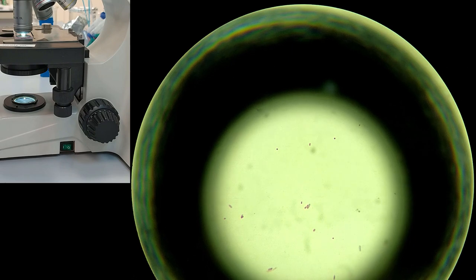Here you can see the rods and the bubbles. And this is the mix of bacteria.